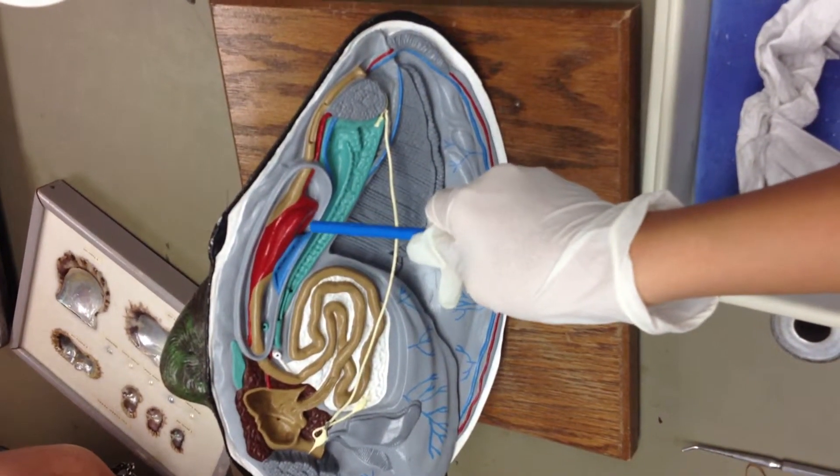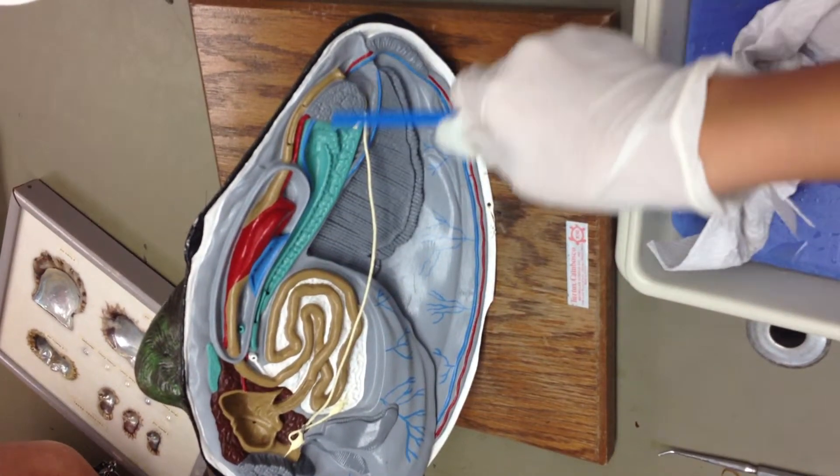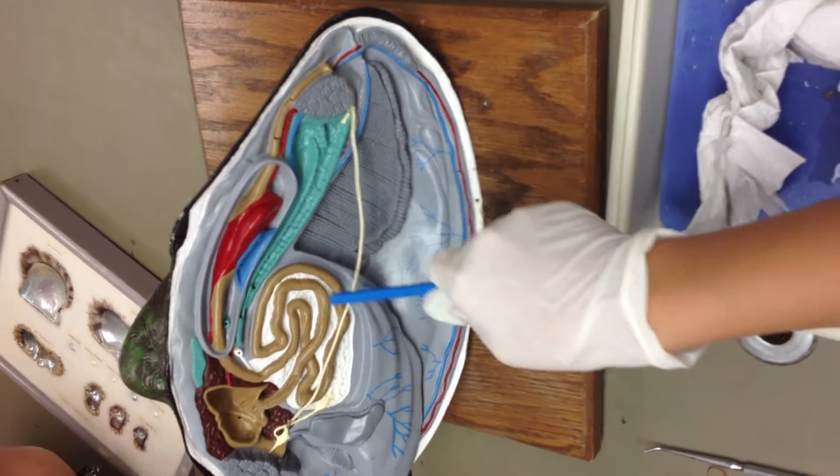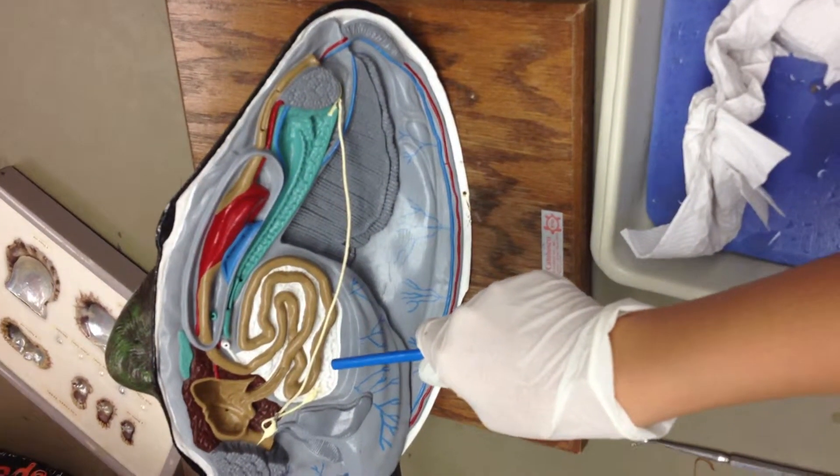That red one is your heart inside the coelom cavity with your gut tube. All of this is your stomach and gut tube. The white one is your gonad.